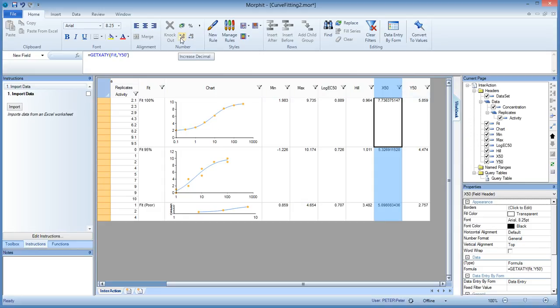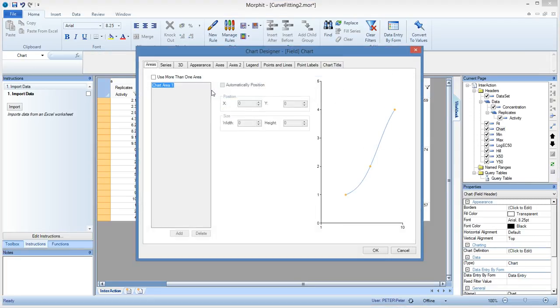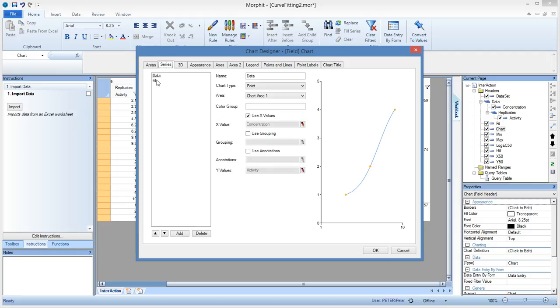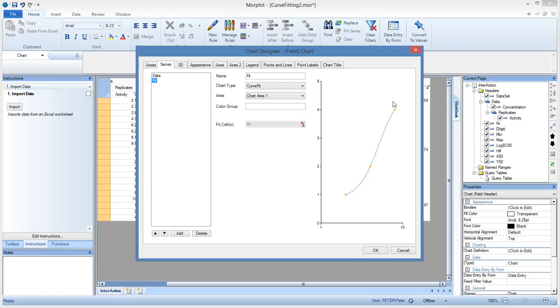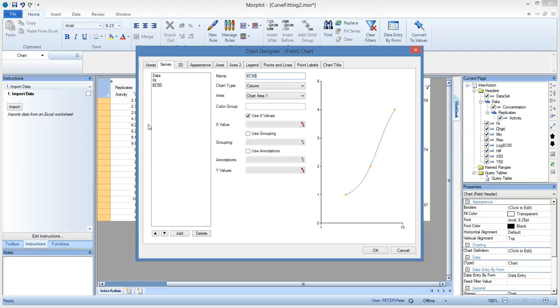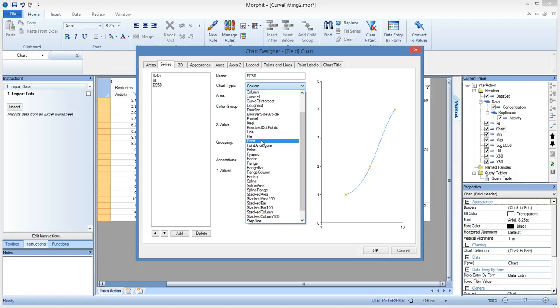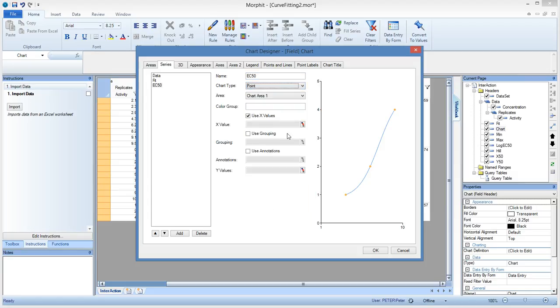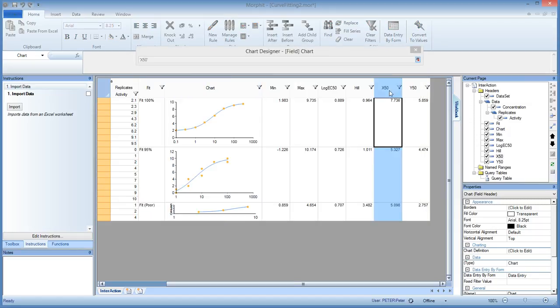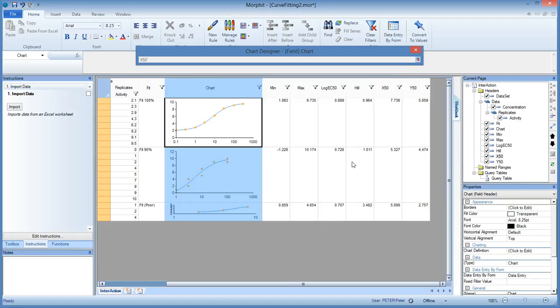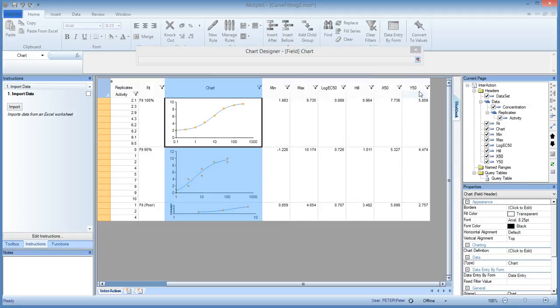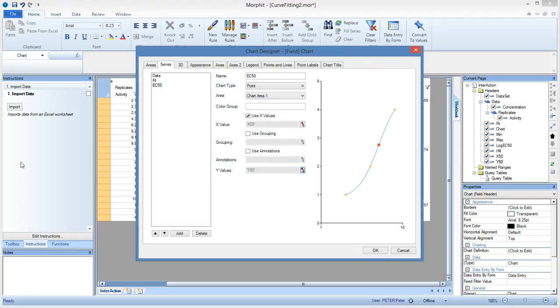So we can now plot this in the chart. And we do that by just double-clicking on the chart header. And that brings up the chart wizard. So we go to series. And there we have the data and the fit. So this was the yellow data points. And this is the blue fit curve. So we add to it a new series. And that's going to be called the EC50. And that is, of course, just a point. And then we are bringing in the X coordinate and the Y coordinate. And that's all we need to do. And here we see in the preview that it is already displaying the EC50 nicely.